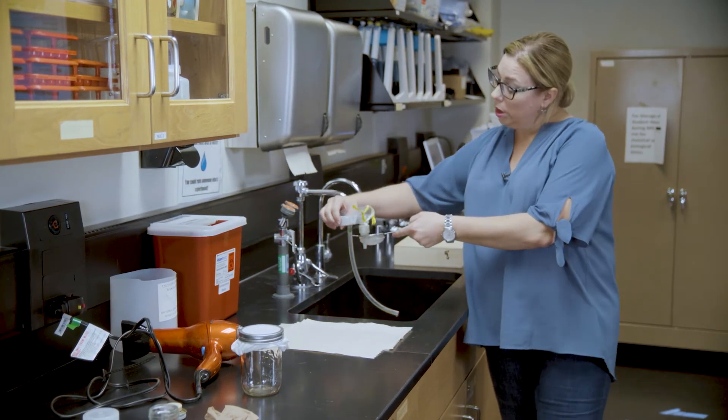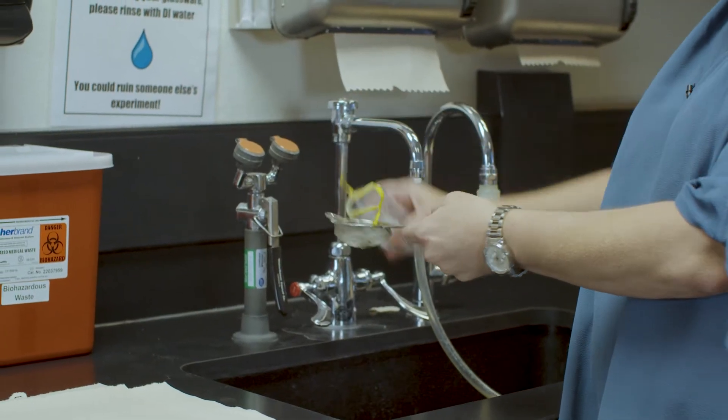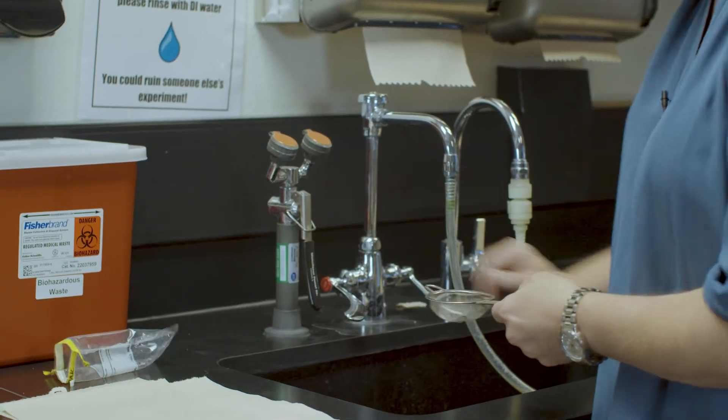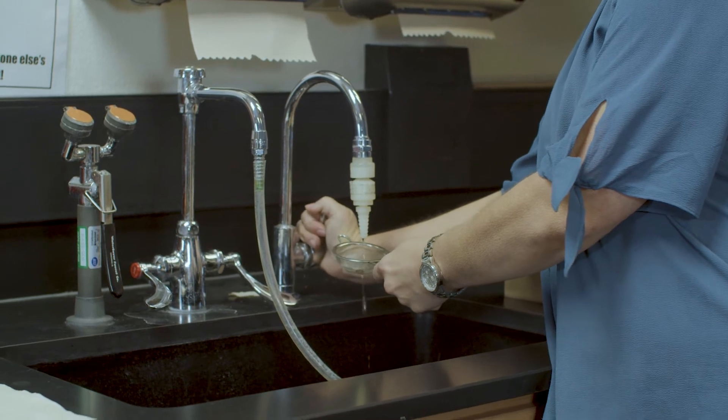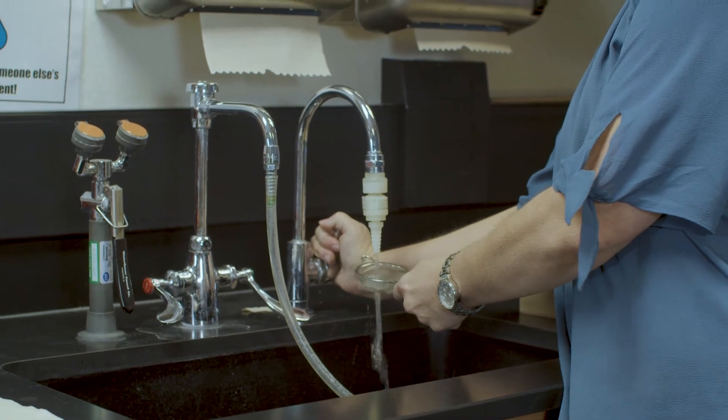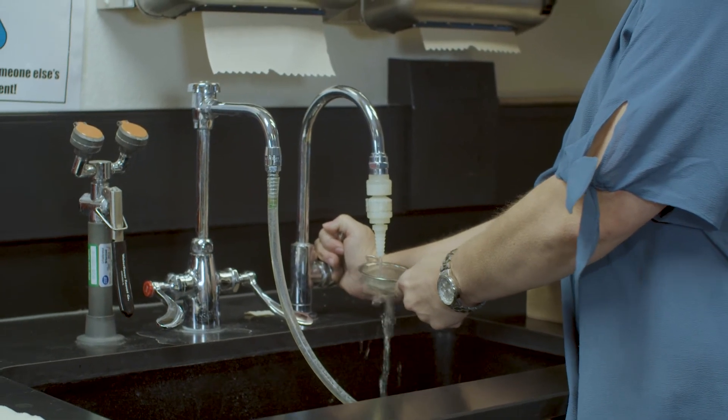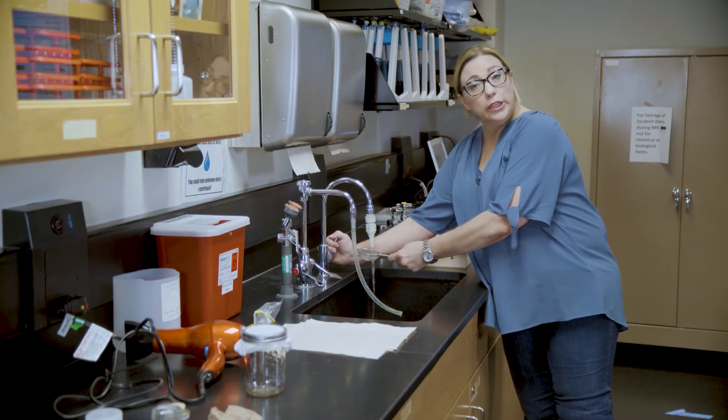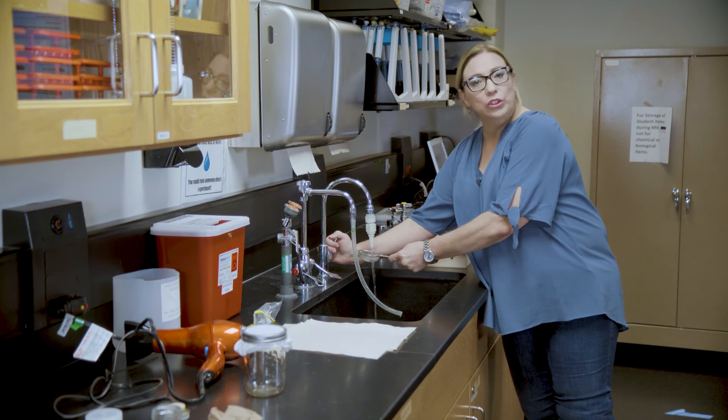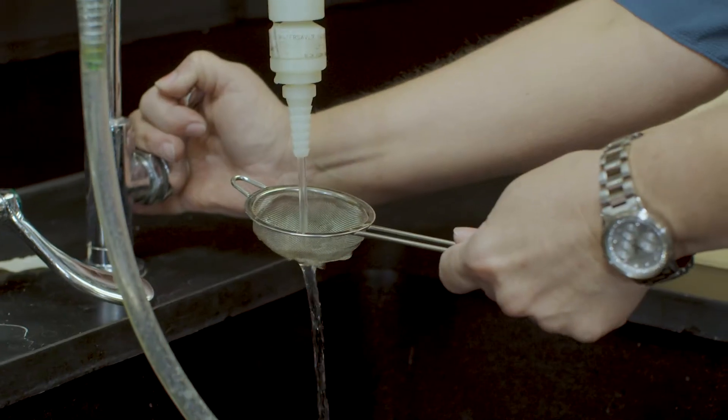You're going to pour the ethanol into your strainer. Now you have to rinse your bee. Remember that they are pretty pliable at this point. You just run a stream of water over your bee. Even if you're looking at pollen on your bee, it will not come off while rinsing.